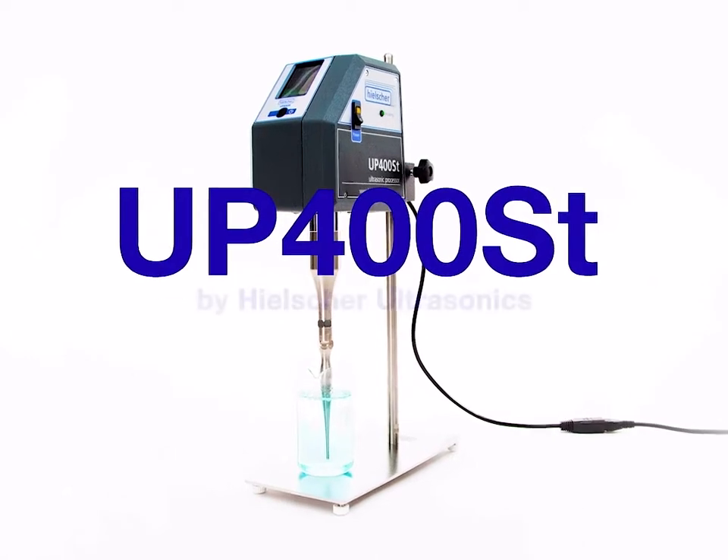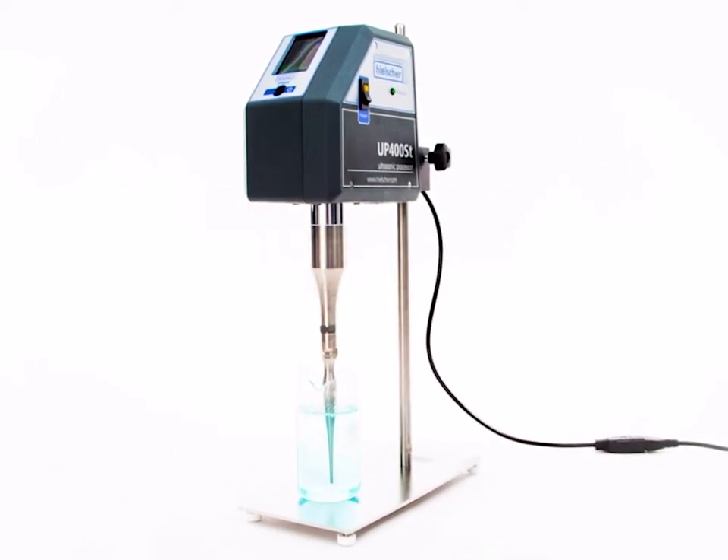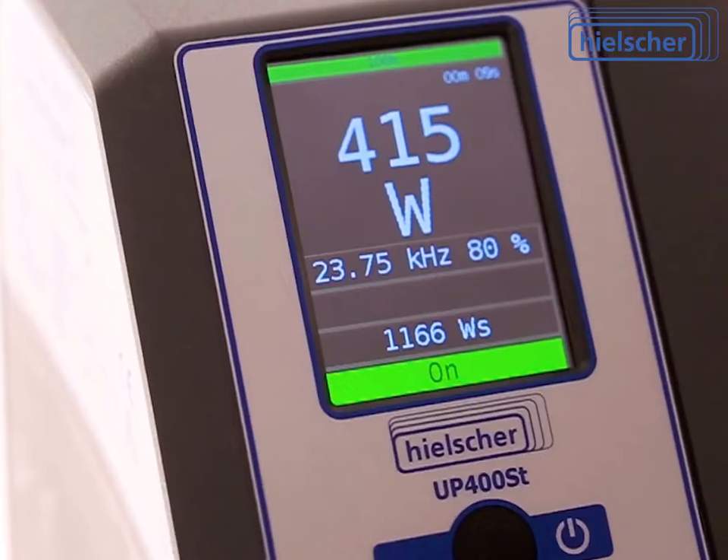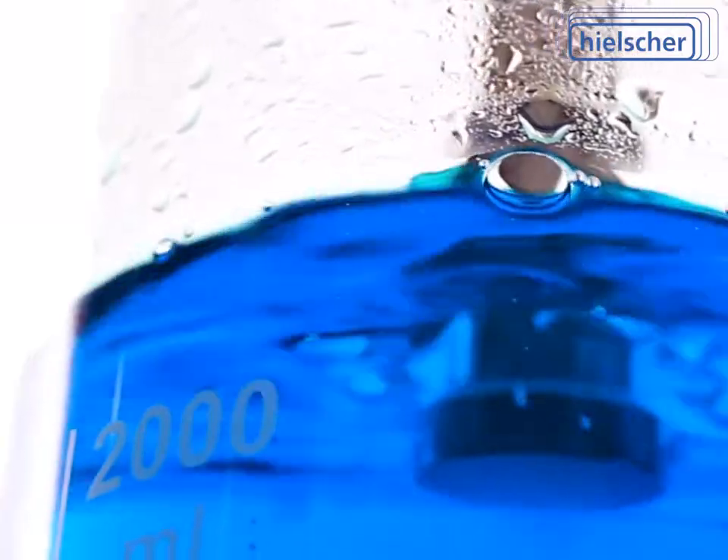Introducing the Hielscher UP400ST, your powerful 400-watt ultrasonic homogenizer. German quality, made by Hielscher Ultrasonics.